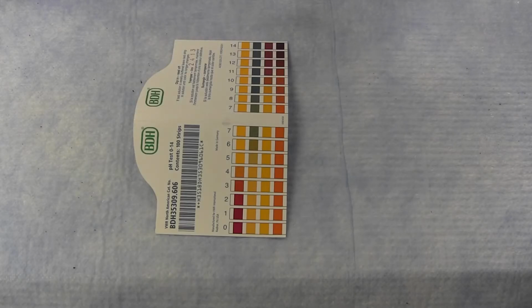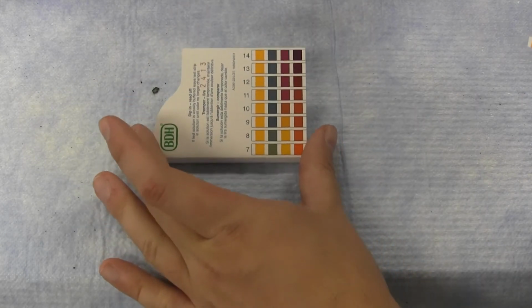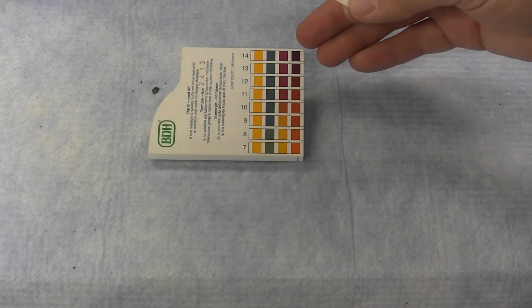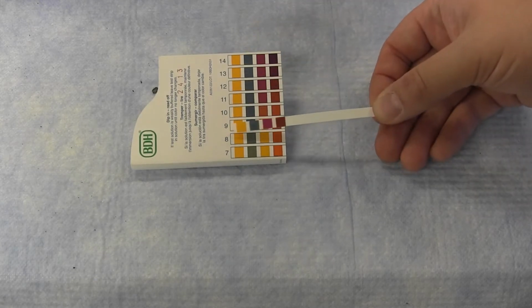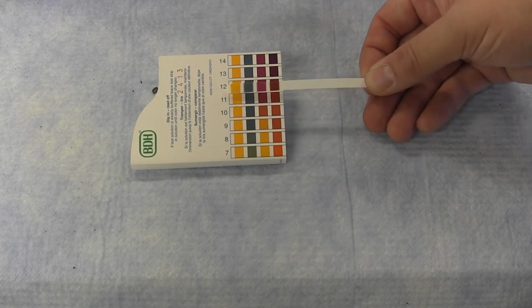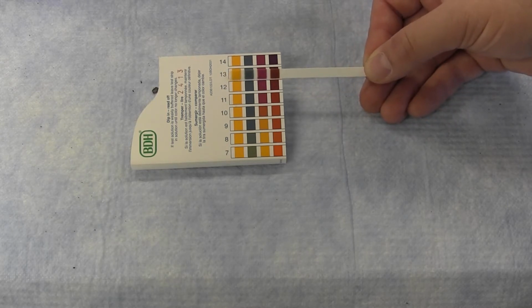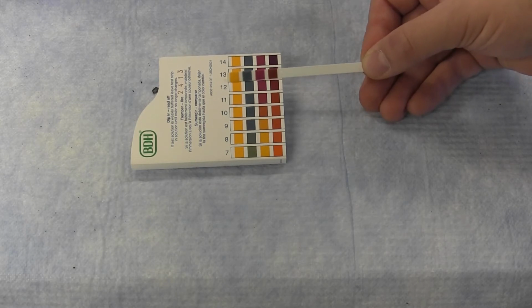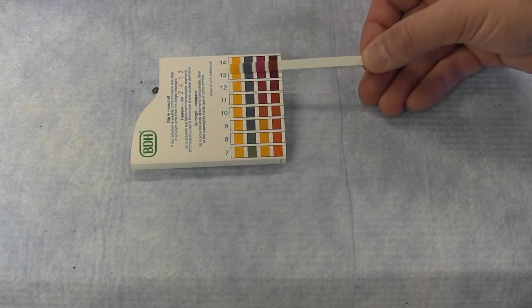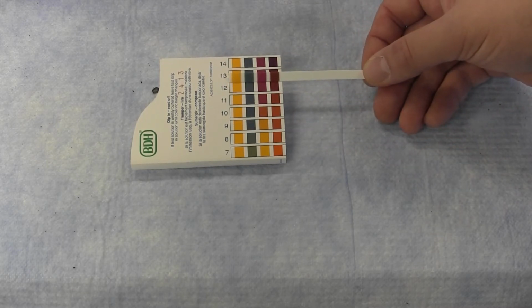By knowing the solution is basic, we can focus on only the basic half of the pH table. By comparing the different colors on the pH paper, we can determine that the pH of the solution is 12. This is the closest matched color for all four different pads on the pH paper.